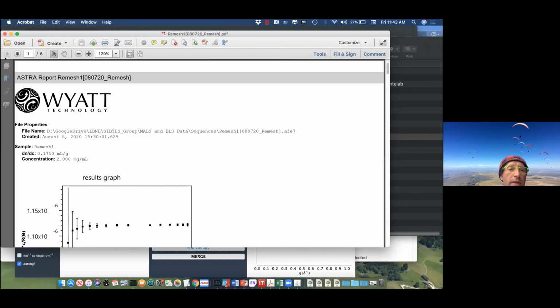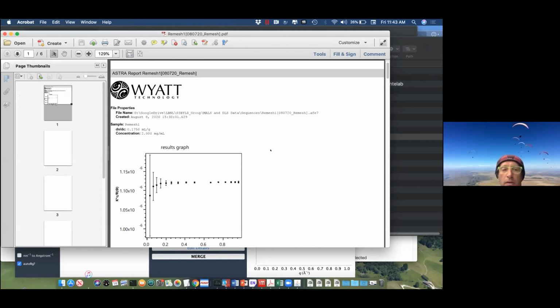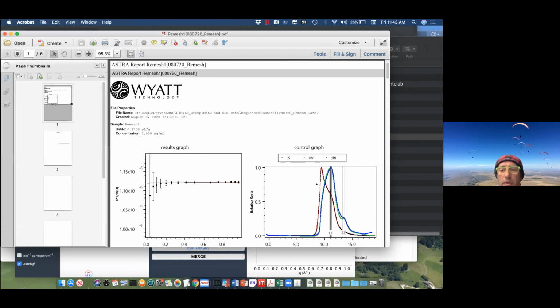This is right here. And what you already see here is there is a very strong peak for the void, so it's aggregation. And there is some separation of the secondary peak that is probably the sample of interest, but it's super, super close, and it's very transient in terms of different monomerization states and different aggregations.